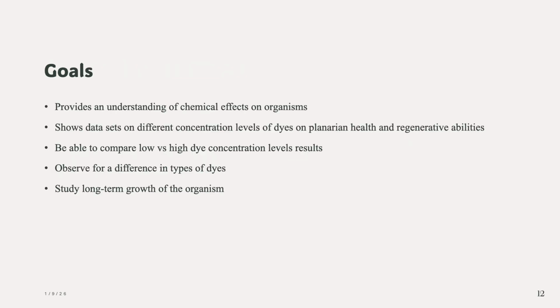The main goals are to provide an understanding of chemical effects such as low versus high dye concentration levels on planarian health and regenerative abilities, observe for a difference in dye types, and study long-term growth of the organism.